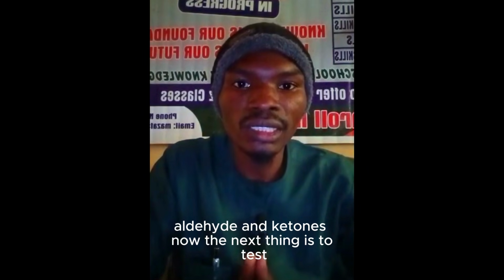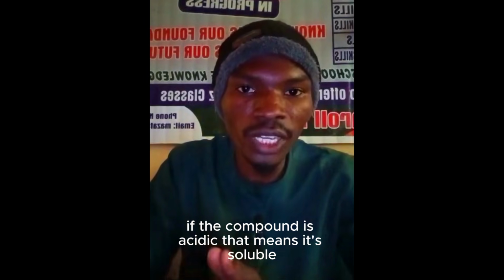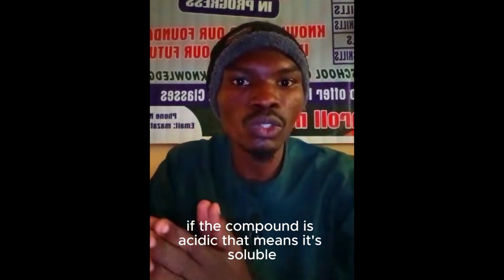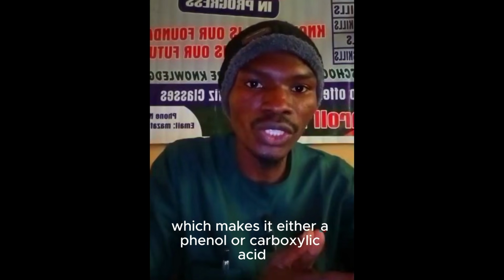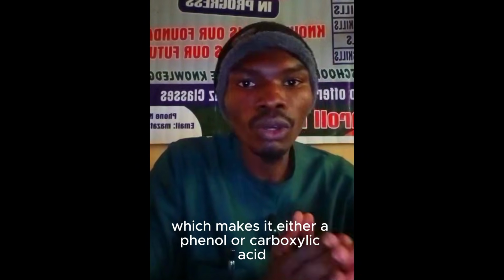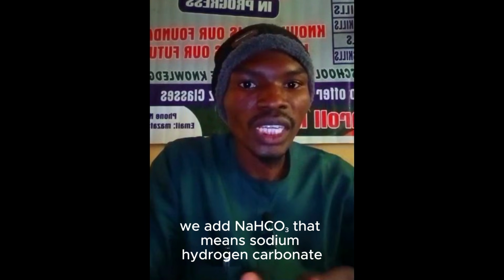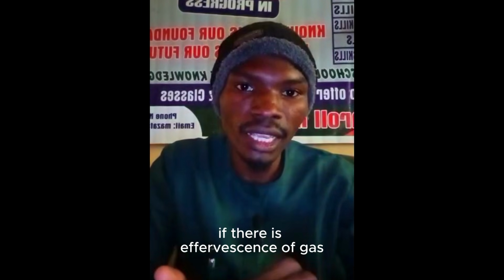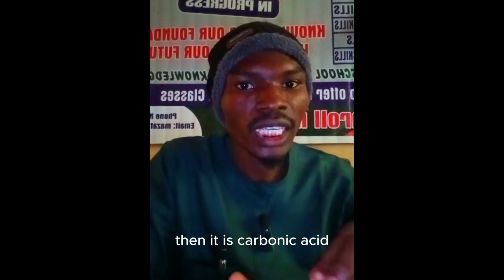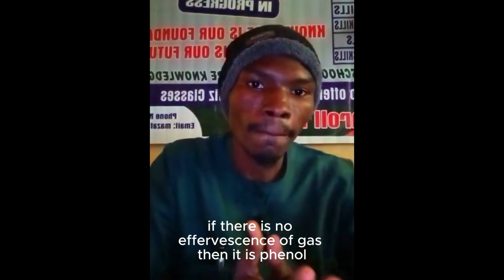Now, the next thing is to test between phenol and carboxylic acid. If the compound is soluble in sodium hydroxide, that means the substance is acidic, which makes it either phenol or carboxylic acid. Now, what do we do? We add NaHCO3, that means sodium hydrogen carbonate. If there is effervescence of gas, then it is carboxylic acid. If there is no effervescence of gas, then it is phenol.